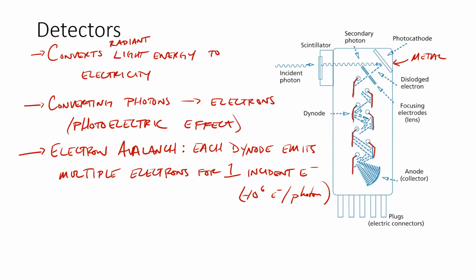For ones that have fewer dynodes, of course, we're going to see fewer. The one that we will see when we take apart a UV vis has just a single dynode, and so you only get a factor of maybe 10 magnification. But we're going to take apart some pretty simple UV vis that are not meant to be sort of ultra low detection kind of instruments.